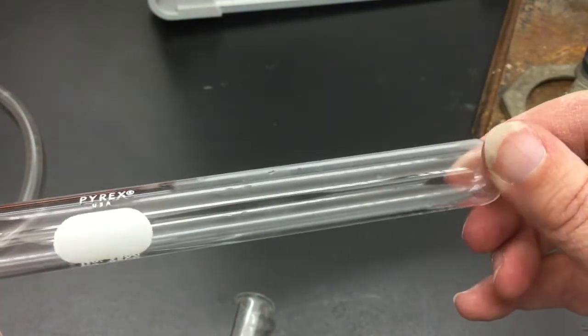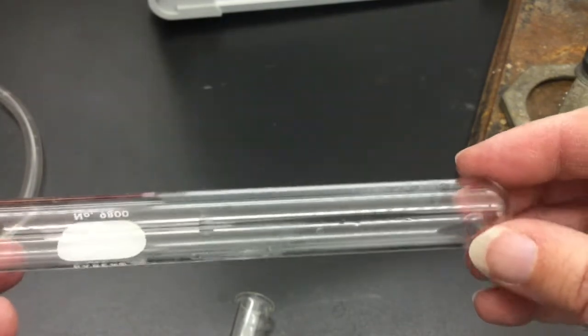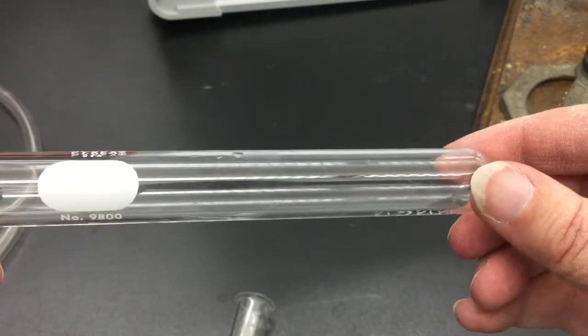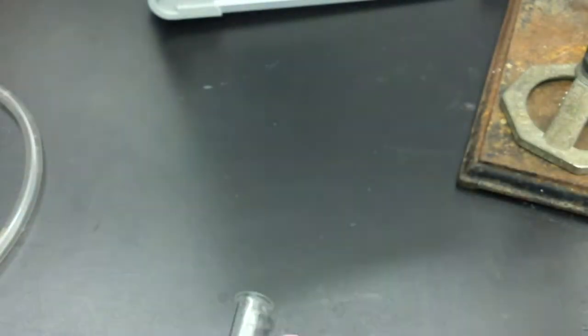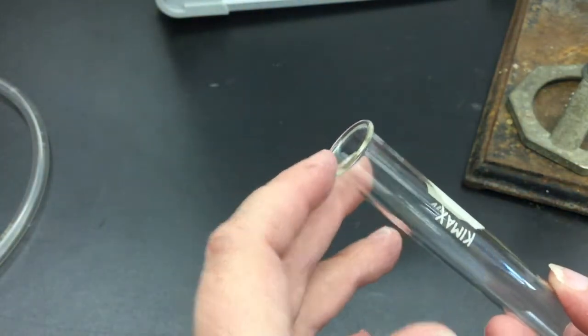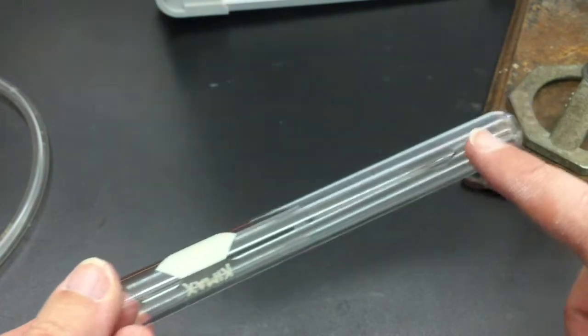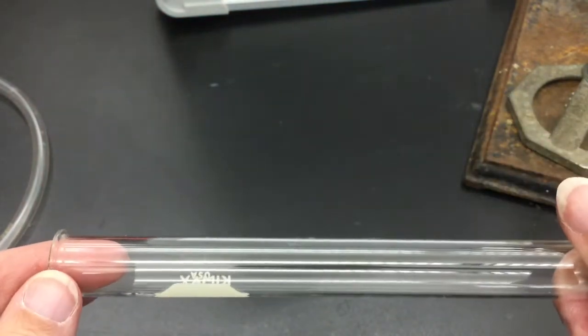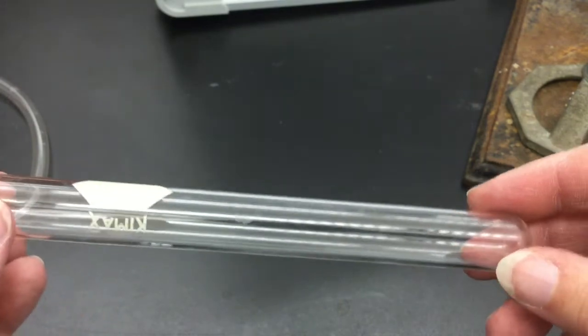So this one is wet and should not be used for this experiment. If you don't have dry test tubes, check with your instructor and see what they ask you to do. Some of the test tubes may have a little bit of chipping around the lip. That's fine. But if there are any cracks or chips anywhere else in the test tube, that can cause it to break, and it should be disposed of.